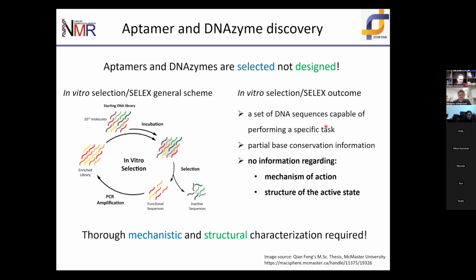And how you get it is that usually we get our samples not from biological ways like in vitro transcription. We get them from chemical synthesis. To get this kind of random library, this is a synthesis similar to peptide synthesis. You synthesize part of the DNA, and then when you want to add the additional bit, you give it a mixture of 4 nucleotides. So in your synthesis, you get basically a sum of each of the sequences that can possibly form. Okay, so you just stop the synthesis when you have a proper length, more or less.